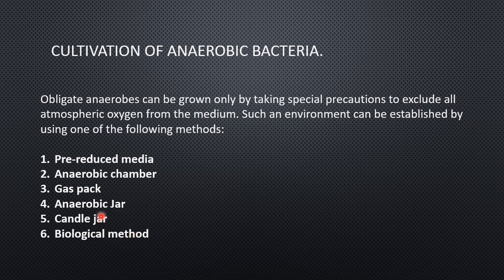Of these, I think you must be familiar with the anaerobic jar and the candle jar, as these are widely used in colleges. If you want to know more about the anaerobic chamber, and you don't have that facility in your institute or college, then ask your professor to arrange a visit where a lot of work is being carried out on anaerobes and where an anaerobic chamber is present, or at least have a demonstration of how the anaerobic chamber works.